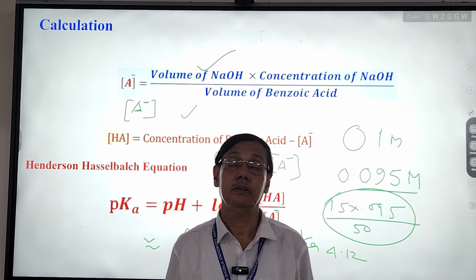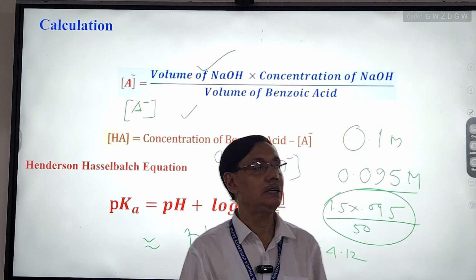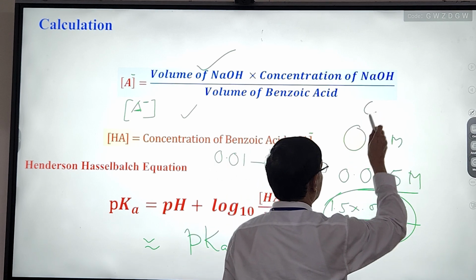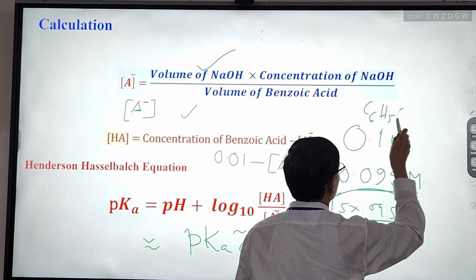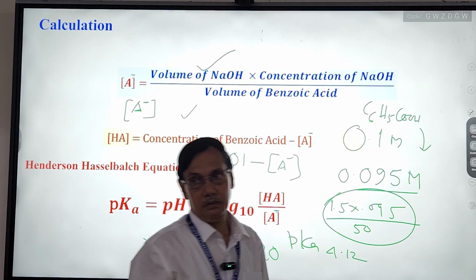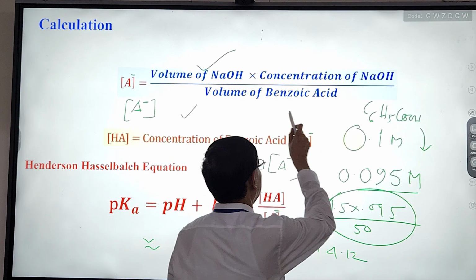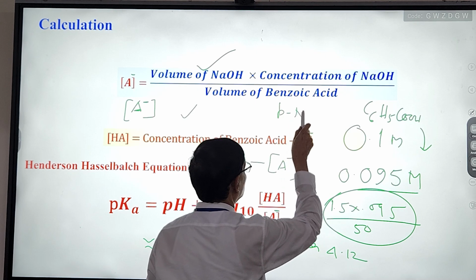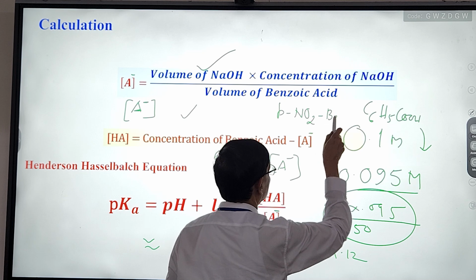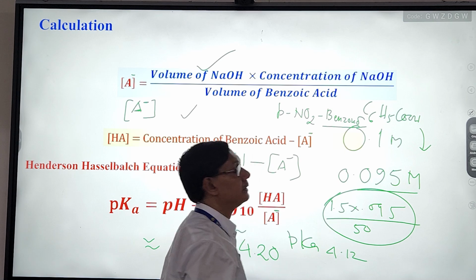But you must be alert, because during the examination, in place of benzoic acid, sometimes we can give the para-nitro derivative of benzoic acid, like para-nitrobenzoic acid, in order to test your knowledge and other things.